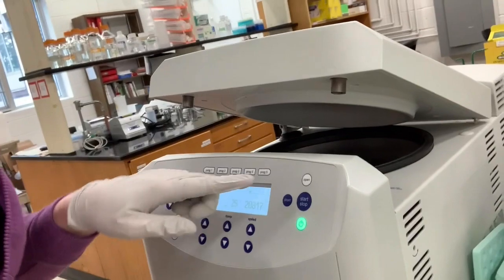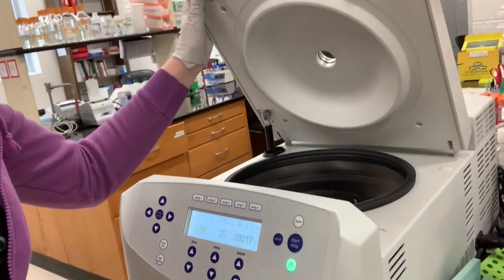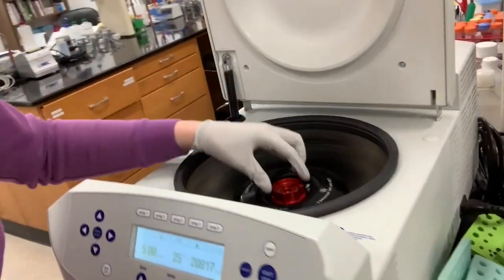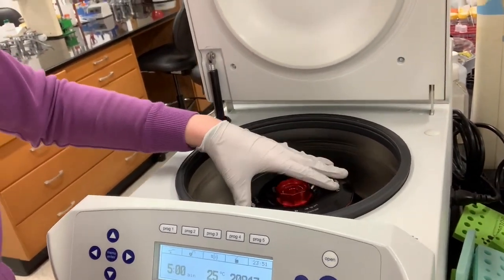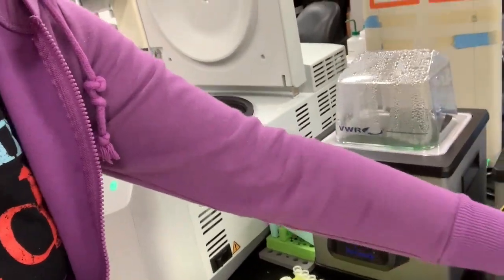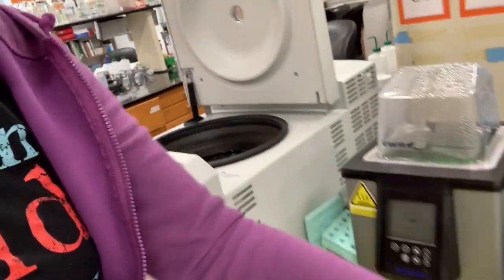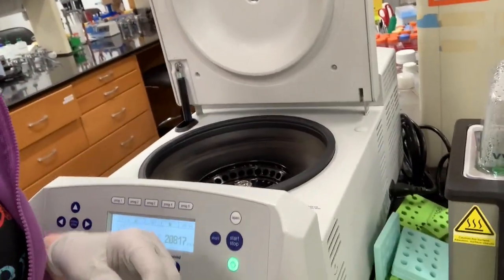So I'm going to open the centrifuge. It has a button that says open. There's a power button here if it weren't on when you got here. You're going to open it up. There's a lid on the rotor of the centrifuge, and you can undo this rotor. Please be careful with this lid. If it gets dropped, it can get bent, and then we have to get a new one.